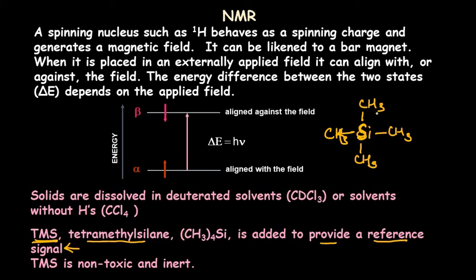And now we can see that there are a total of 12 hydrogens, which is a number big enough to produce a very sharp peak. Because there are 12 hydrogens all together, it's going to produce a very sharp and very high peak, and a single peak is produced. The reason is that all these 12 hydrogens are in the same environment.